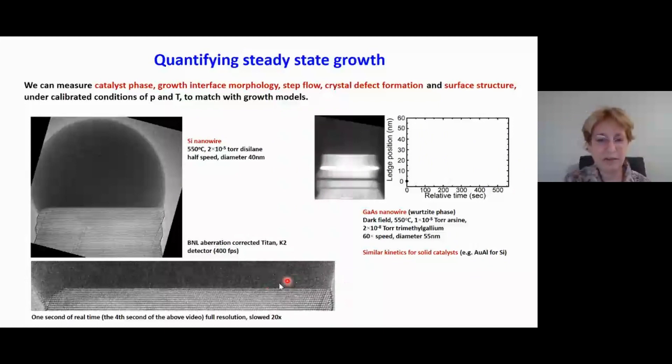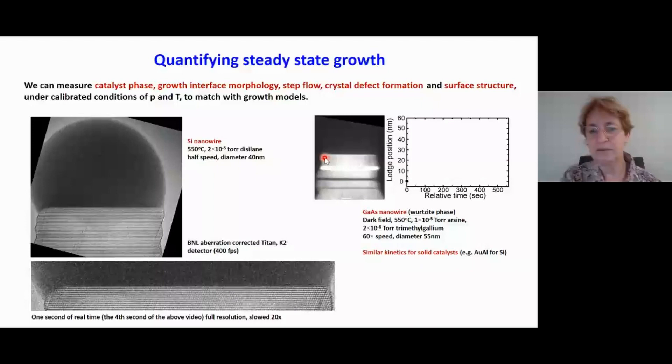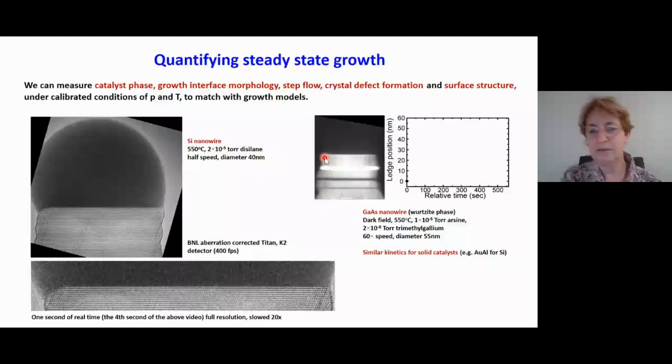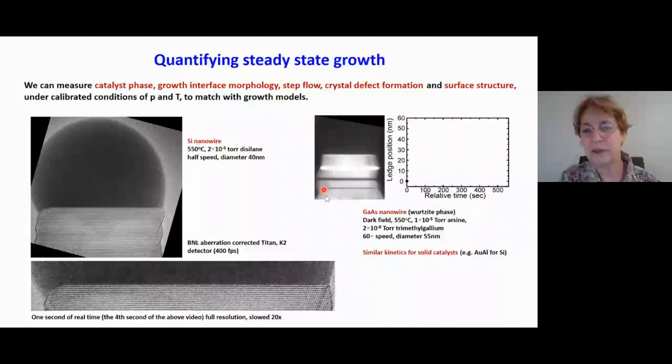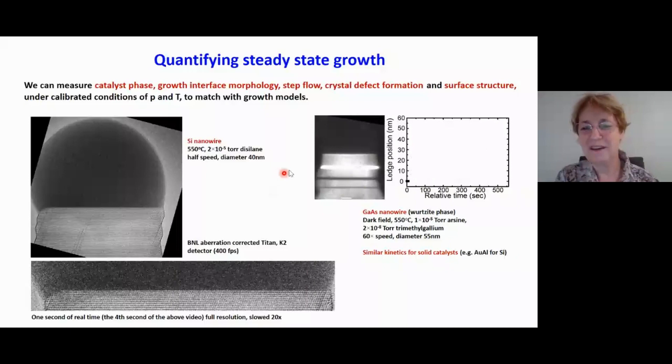Let's compare this growth of silicon from a gold silicon liquid to the growth of gallium arsenide from a gallium droplet. Here's a dark field image. The imaging conditions don't show the catalyst very well, but can you just see it there? The droplet is just there. If we look at this kind of growth, what you see is a more continuous flow. Do you see the action at the interface? The atomic layers of gallium arsenide are adding in a much more continuous way.